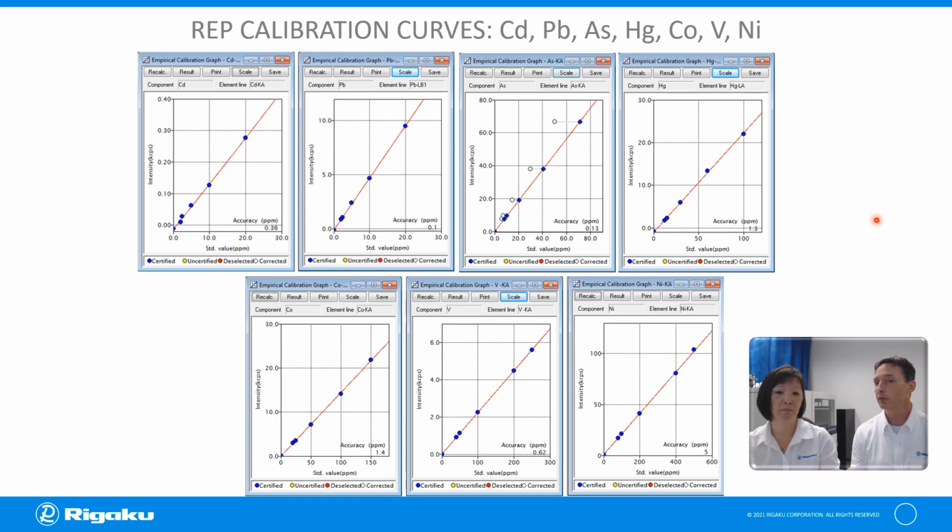Some of the examples that are given are a 10 gram daily dose. It becomes more difficult for an instrument like XRF as we go up to higher and higher maximum daily dose levels. So something like Pepto-Bismol or a calcium carbonate type material, like an antacid. If you're taking 10 grams, 100 grams of something like that in a day, you're going to have much lower concentration limits. In those cases, those are going to have to be ICP techniques. But we're going to focus on where there's a big convenience for a system that's kind of meant to do quality control analysis. There's an advantage for looking at most of your materials that would be in this concentration range.